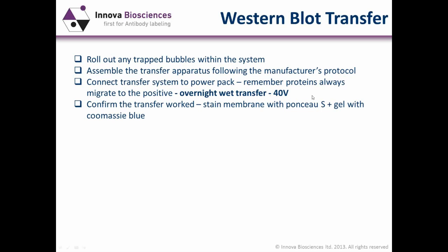One thing with the Ponceau S is that before you proceed to the blocking stage, where you're going to block your membrane, I would strongly recommend making sure that all the Ponceau S is removed. You simply do that by washing the membrane in copious amounts of water and leaving it on a shaker for 5 minutes. I would recommend doing three 5-minute wash steps, just to make sure you got rid of all the residual Ponceau, because you don't want it affecting your transfer process or your probing process further down the line.